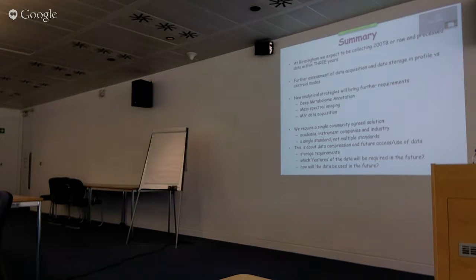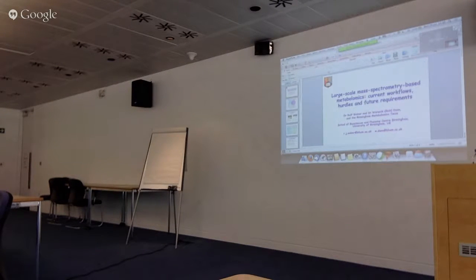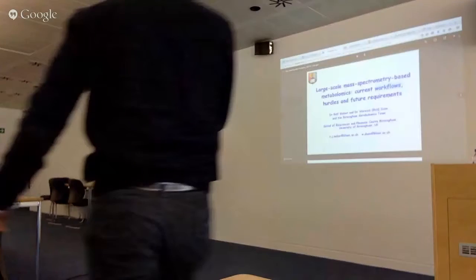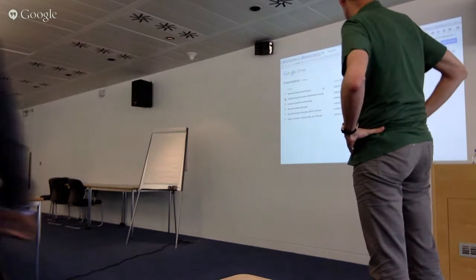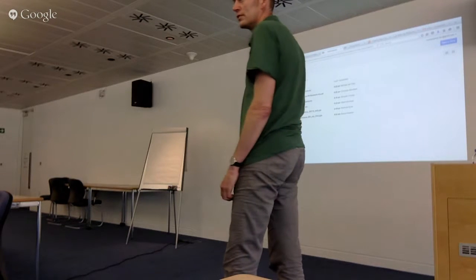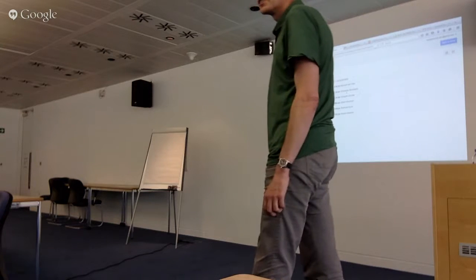When people are studying mzXML, mzML is the one that was agreed as the standard. I'm pretty sure that mzXML will be used less and less because it also has a lot of problems for extending it. So I think the problem of having just one standard format for data will be solved this way.